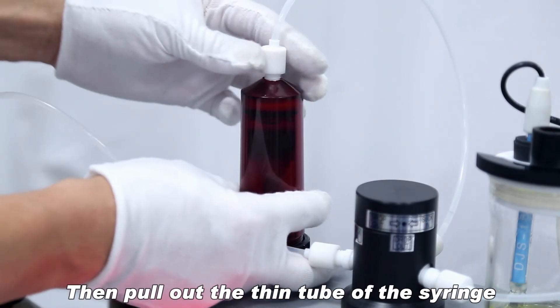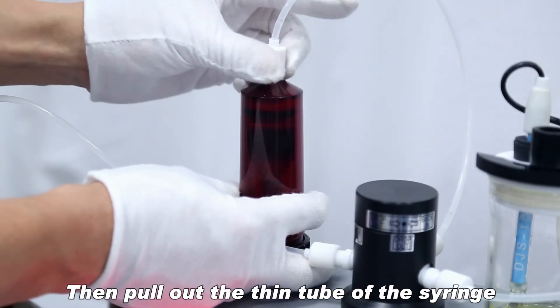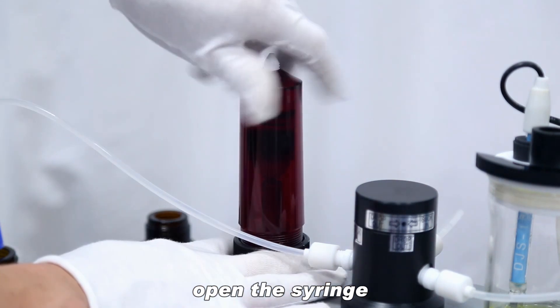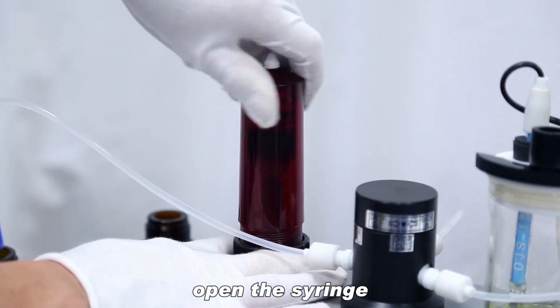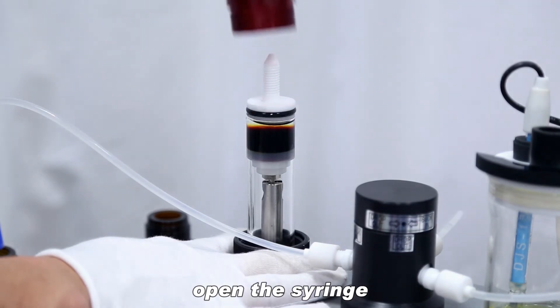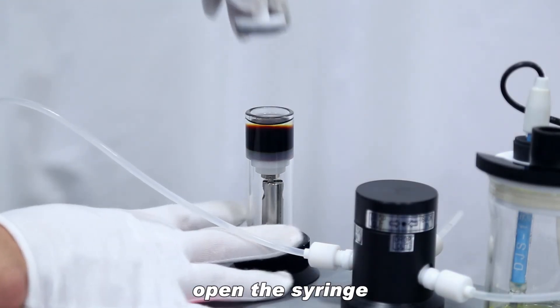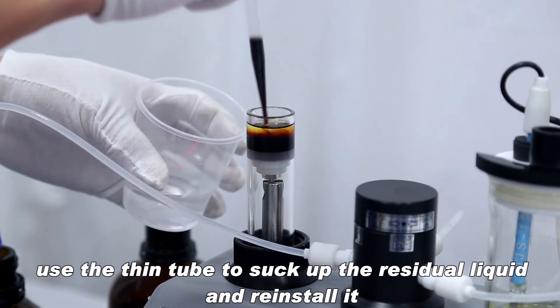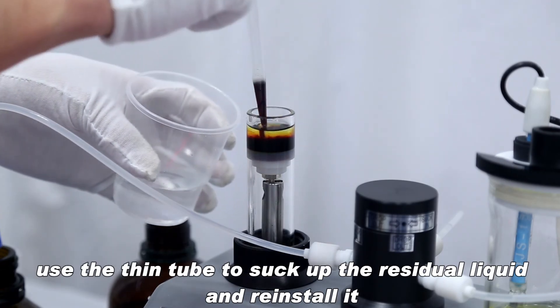Then pull out the thin tube of the syringe. Open the syringe. Use the thin tube to suck up the residual liquid and reinstall it.